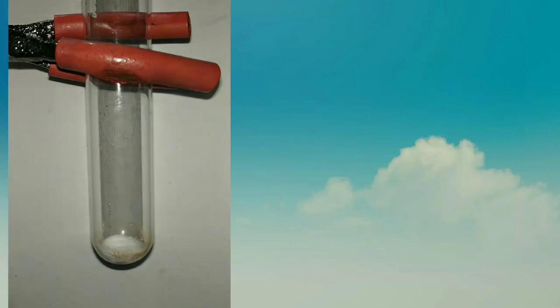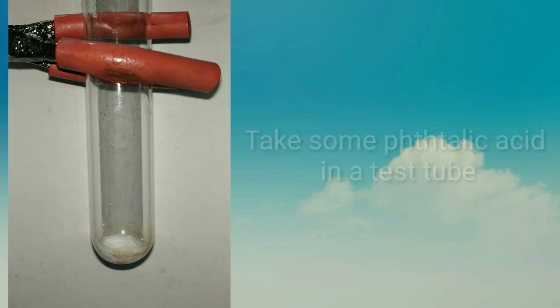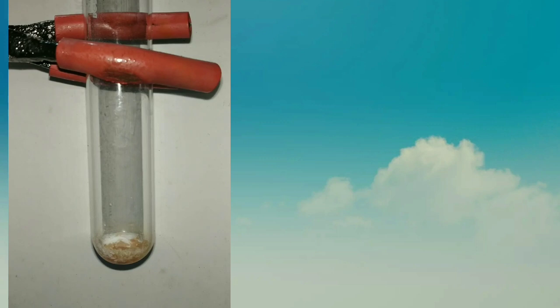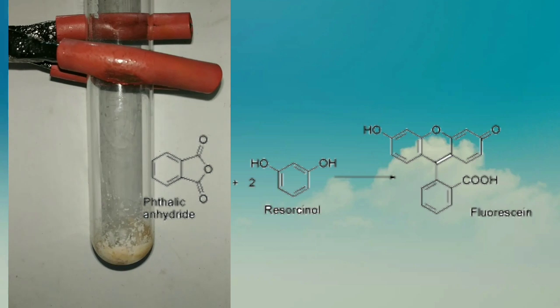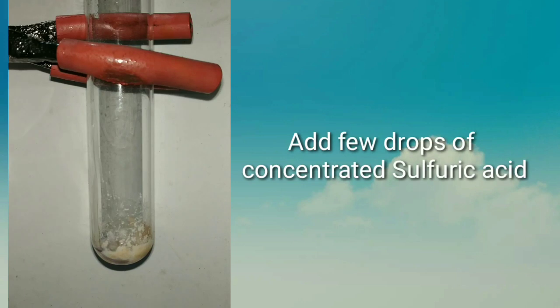This is the classical demonstration of the phthalein reaction in organic chemistry labs. We have taken some phthalic acid in a test tube and into which we will be adding some resorcinol, and then we add concentrated sulfuric acid. The concentrated sulfuric acid will cause dehydration of phthalic acid, forming phthalic anhydride.